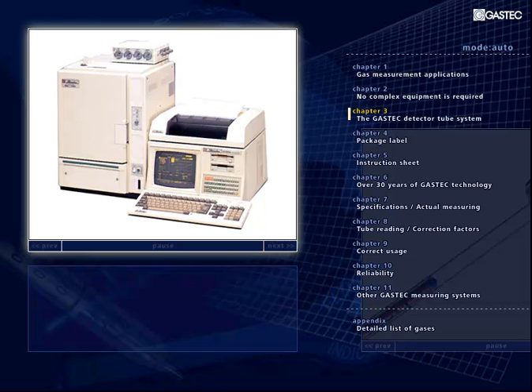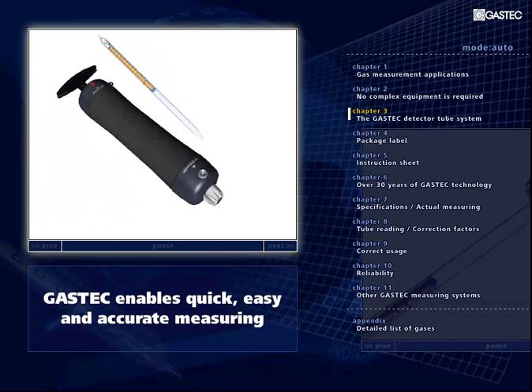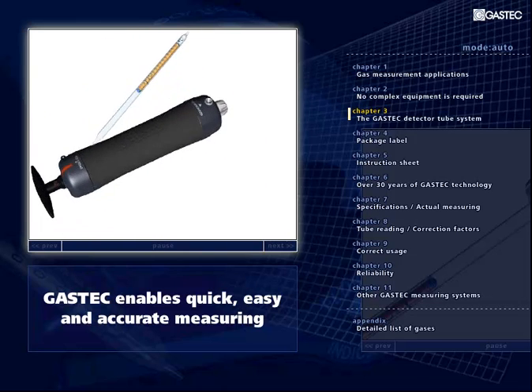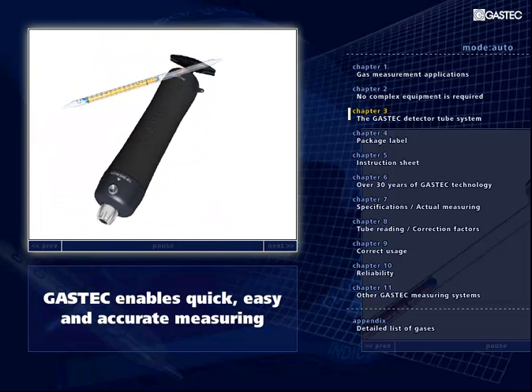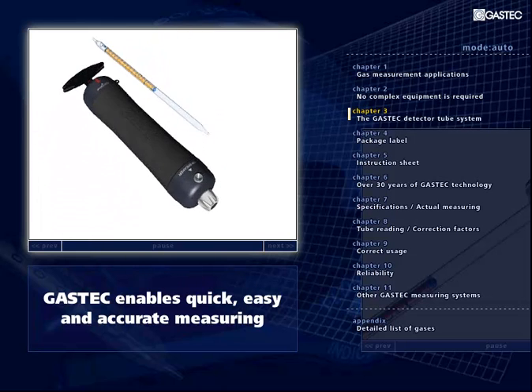Since such apparatus, as well as the process of analysis, involved specialized knowledge, required considerable time, effort, and expense, it could not be used simply by anyone nor anywhere in day-to-day practice. In contrast, detector tubes, due to their simple handling, enable flexible and prompt response to various critical situations by anyone with a basic knowledge of their application while ensuring safety.